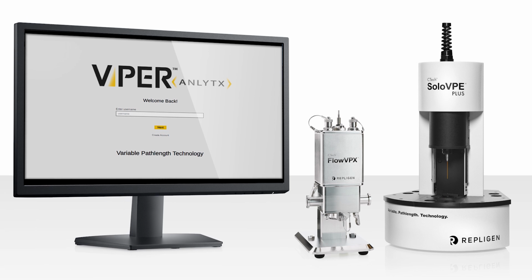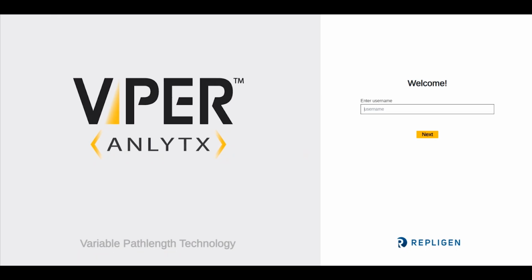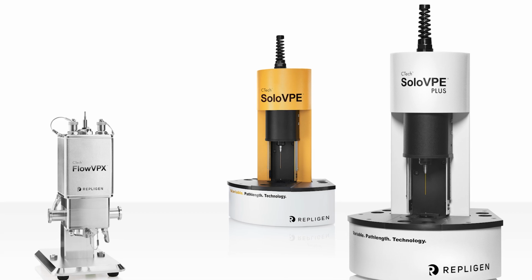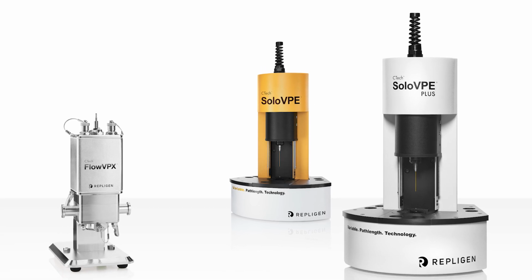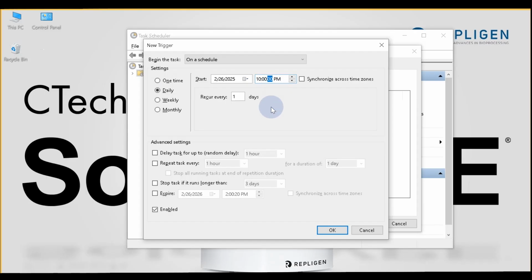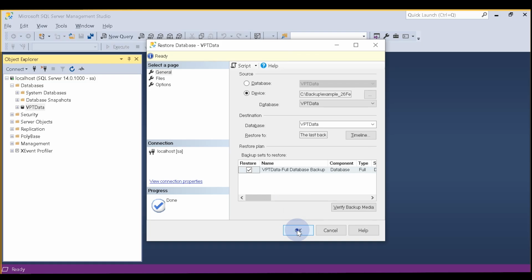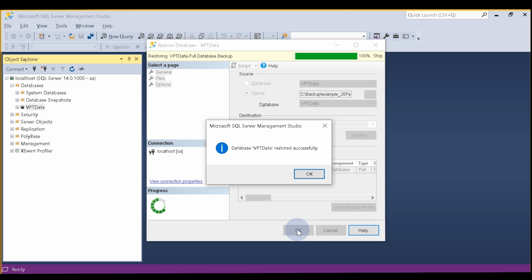This video explains how to back up the database for CTech ViPER ANLYTX software, the control software for variable path length technology instruments. We will cover how to create a manual backup of the database, how to automate regular backups, and how to restore a database that has been previously backed up.